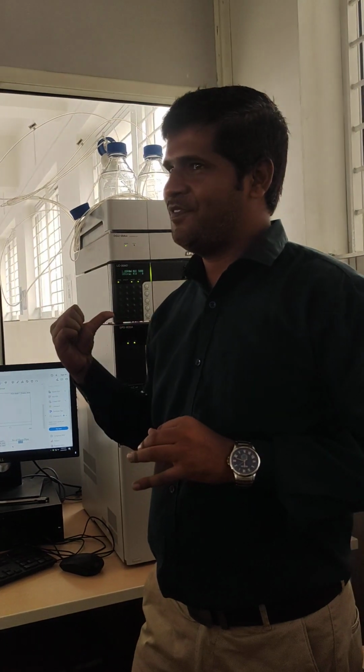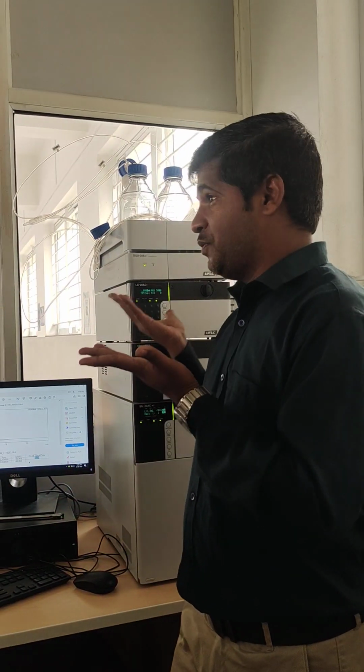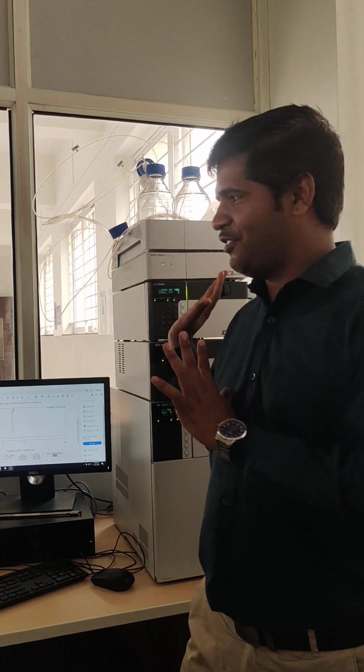I hope all of you are understanding this HPLC. So I have told all the sections, means what are the points related with the asymmetry, system suitability, then number of theoretical plates, what is the meaning of number of theoretical plate, retention time, then principle of these, working of each part of the instrument, then procedure of HPLC, all sections I have covered. So any doubt related with this?